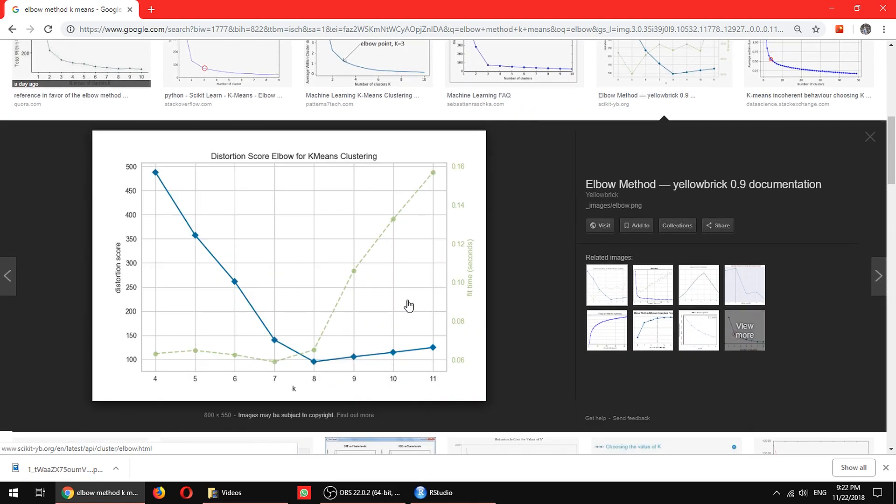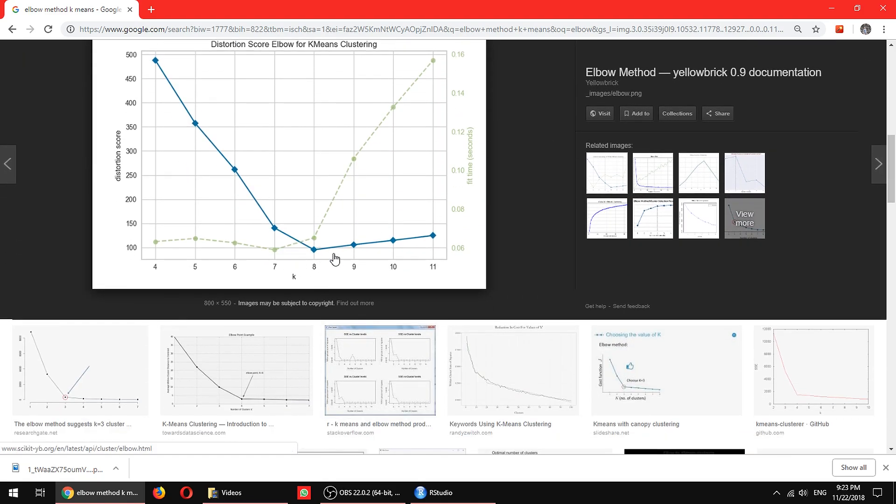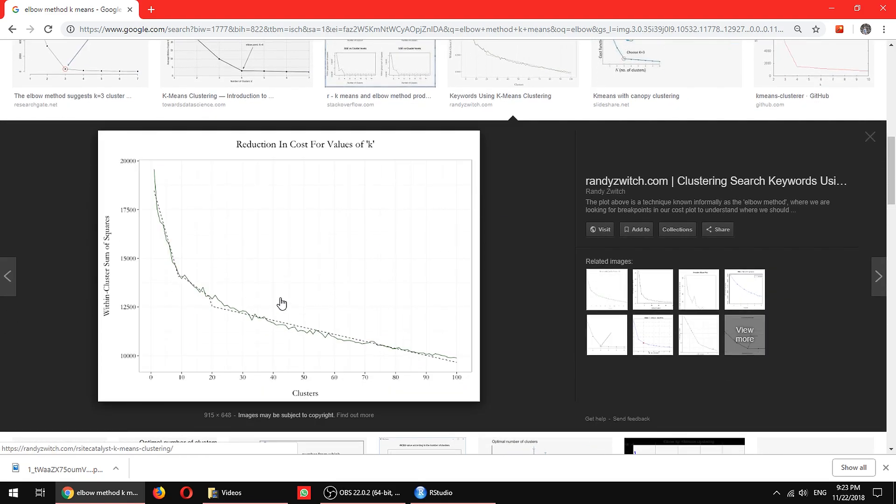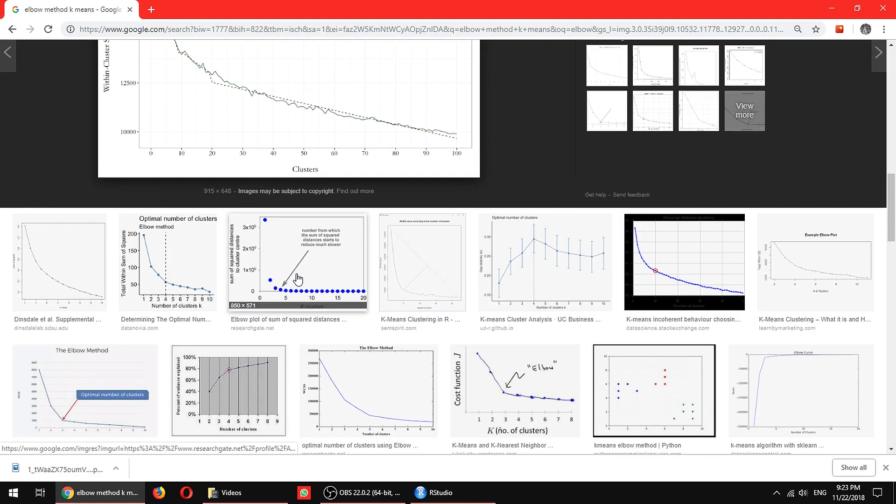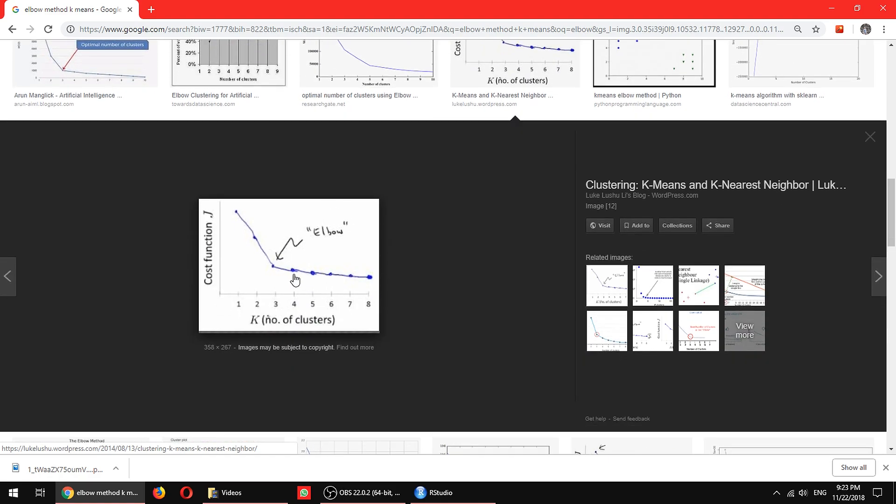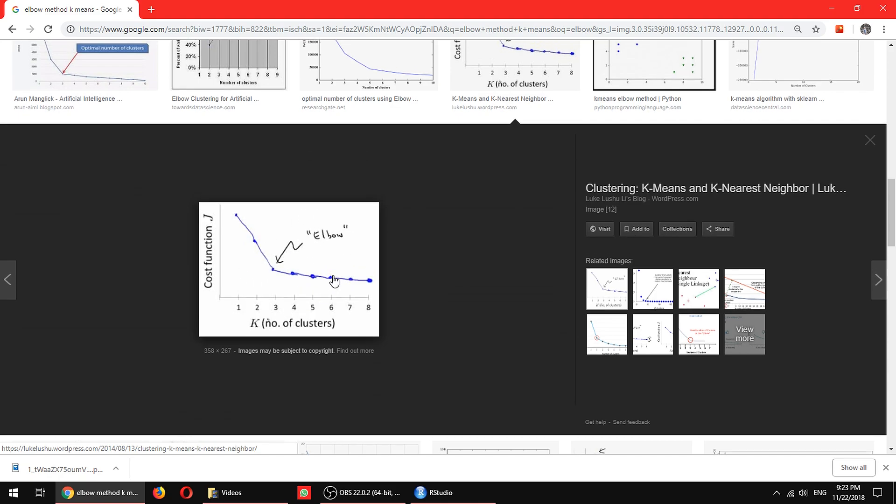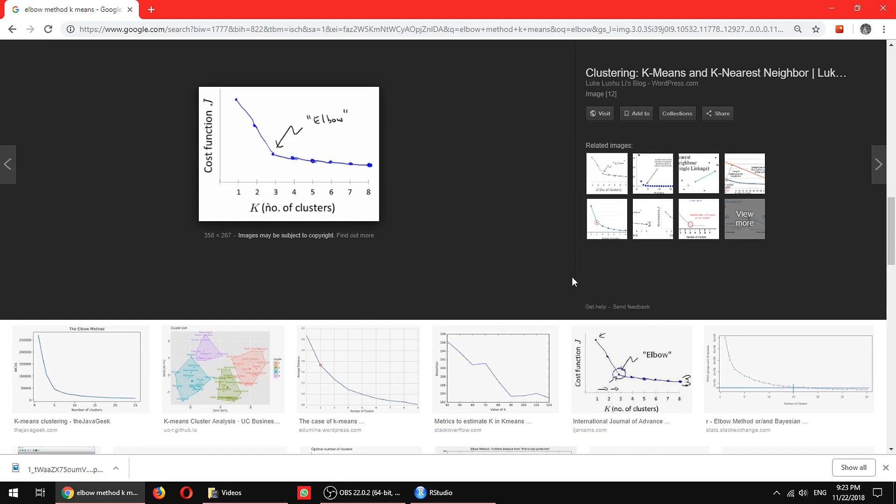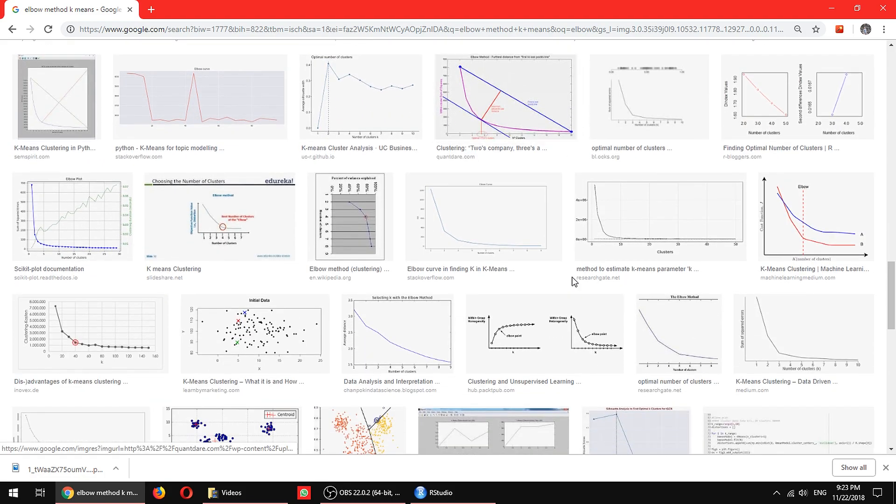If you go down, you can see there's an elbow over here. Here it's not that clear, but it's somewhere in between here. You can see there's an elbow on the third cluster of k-means. So elbow method is not the only method you have.